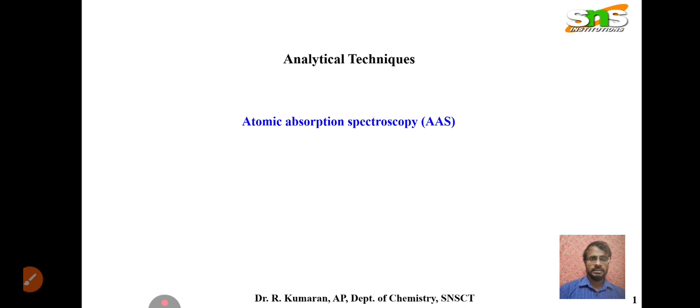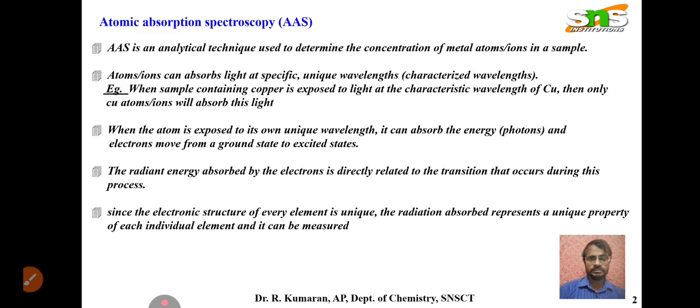In this video, we are going to see about one of the important analytical techniques called AAS, Atomic Absorption Spectroscopy. First, we can see the basic aspects and principles of atomic absorption spectroscopy.